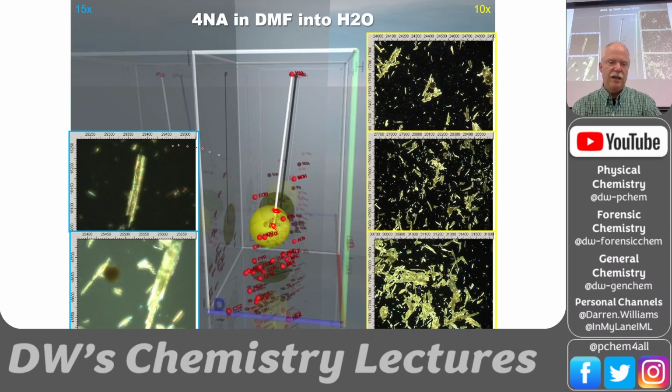And you can see that the crystals are not well formed because it crashes out so fast. It started to form some needles, but you can see there's lots of irregular shapes here because of the violence of the precipitate. It starts to grow, but then it crashes out as soon as it gets so big that it can't stay in solution anymore.